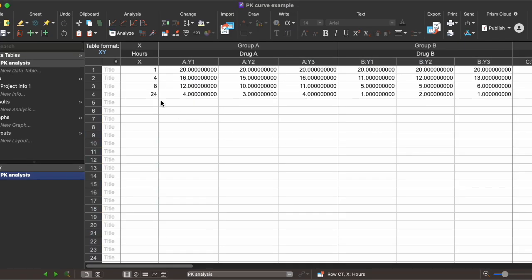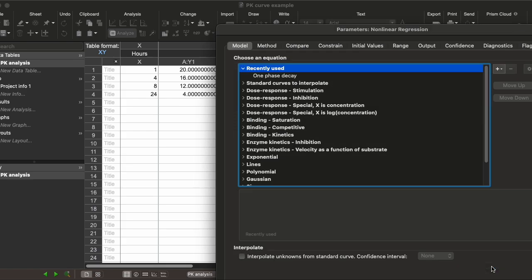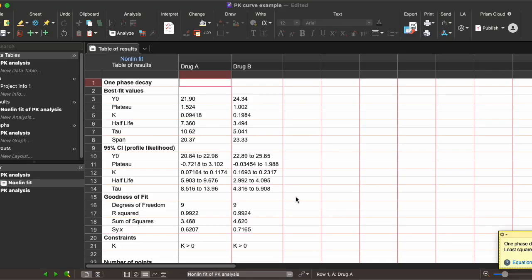Now if we get into the analysis, you can click on Analyze and go to nonlinear regression to make a curve fit of our data. Prism automatically selects our two data sets and we click on one-phase decay, giving us this list of decay values.